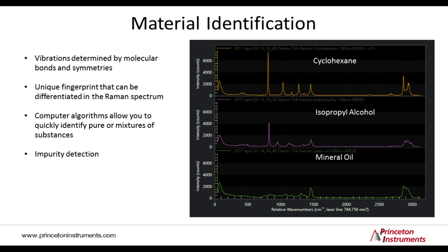However, someone might also note some similarities in the Raman lines of these two substances that can be attributed to vibrations of parts of similar structure in each of these hydrocarbon molecules. Also shown is a spectrum of mineral oil that is fundamentally of a more complex nature, as it consists of very many different molecules and hydrocarbons of very different kinds and length.